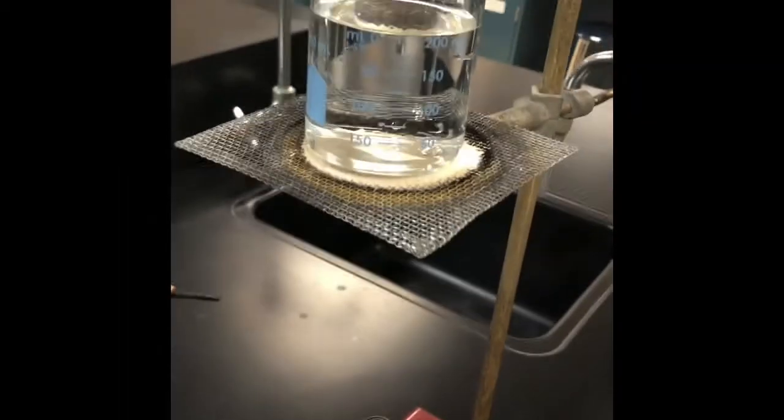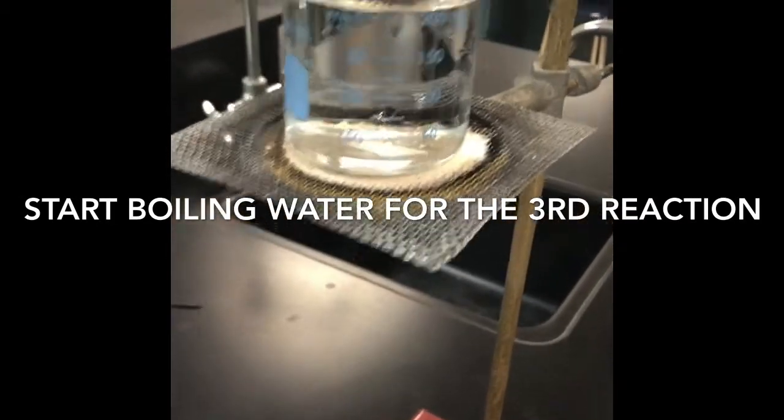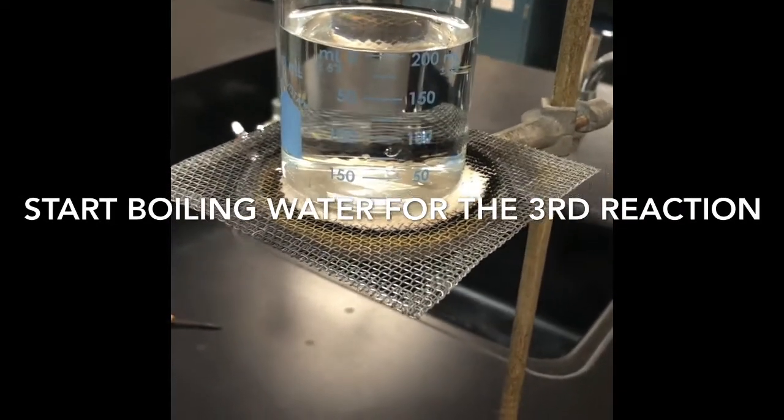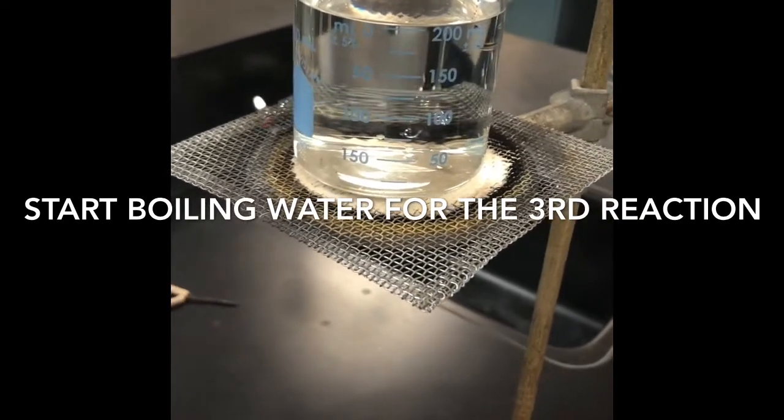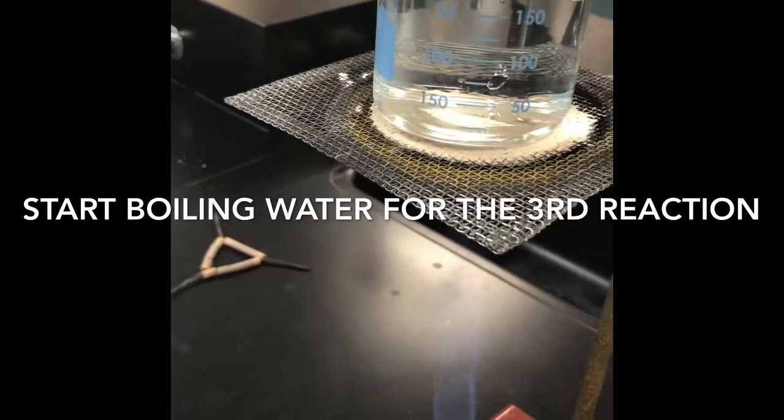The first thing it tells us to do in this lab is to get some water boiling. So what I did is I measured out about 200 milliliters of distilled water. We're going to light it. We're going to get it boiling for the third reaction.